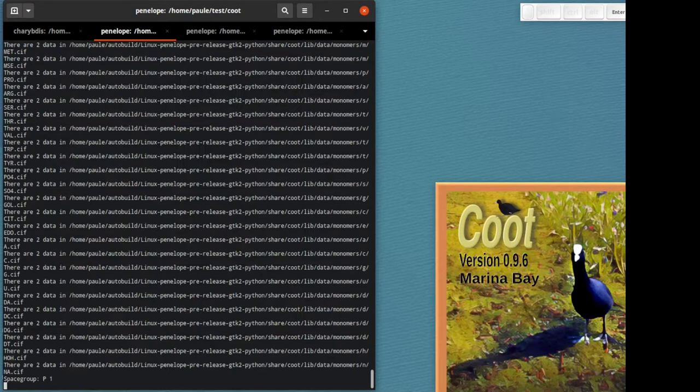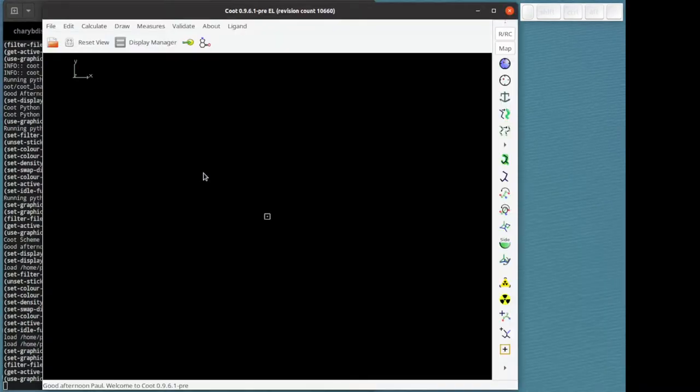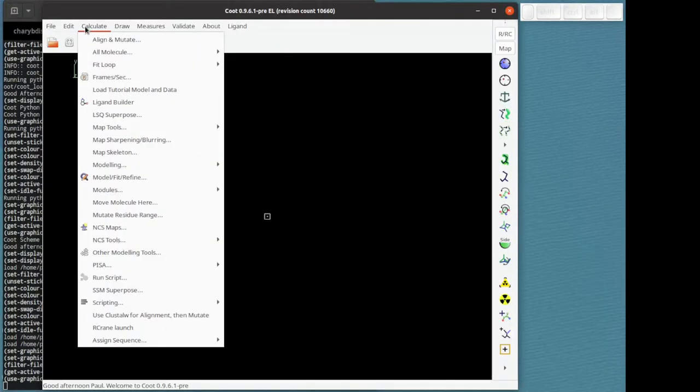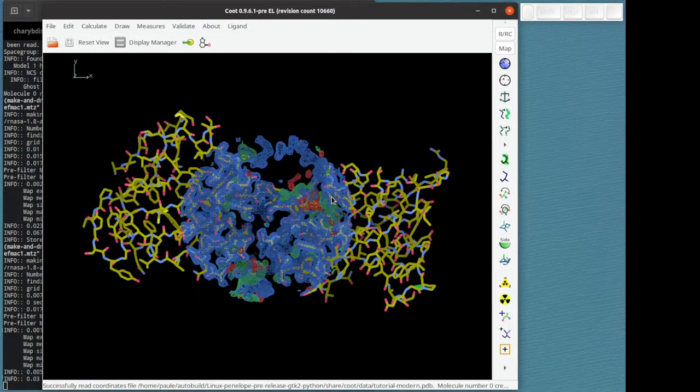I'm going to fire up my Coot. First of all, let's load the tutorial data. There we go.